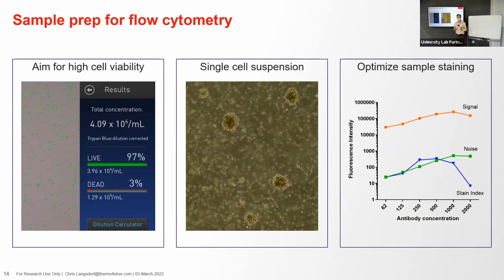Two or 3 cells stuck together, that's fine, but we don't want long strings of mouse spleen or something going through our instrument, because it clogs it, and it's not single cell analysis. Like we mentioned before with the cytometer picks, it gets confusing if we have many cells stuck together that are expressing given markers. It makes the results of our experiment confounding. And so ways to accomplish this, we can use a pipette tip, aspirate up and down, to break up our cells. We can use filters. We use a 70 micron or a 30 micron filter tube and just put our cells in and then run them, filtering out these larger chunks before we run.